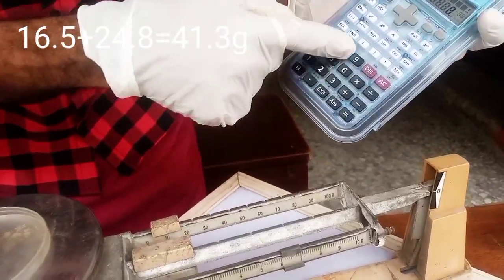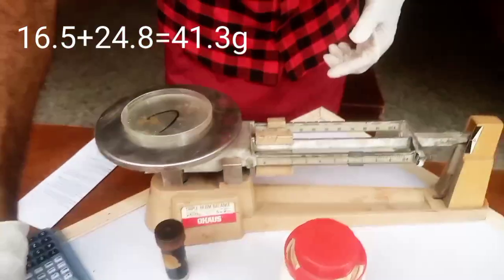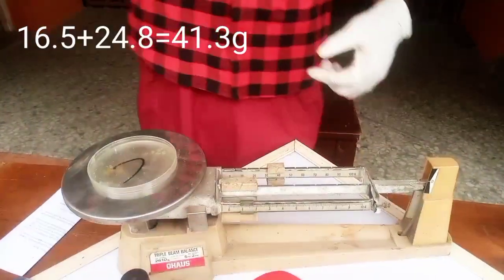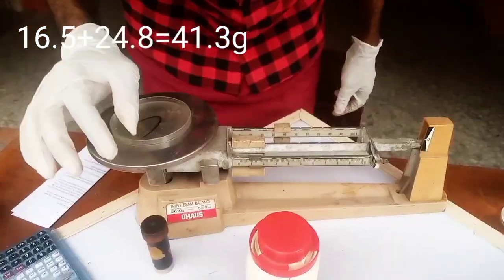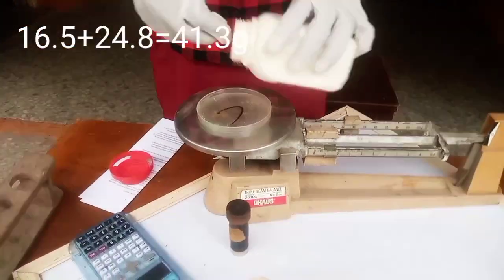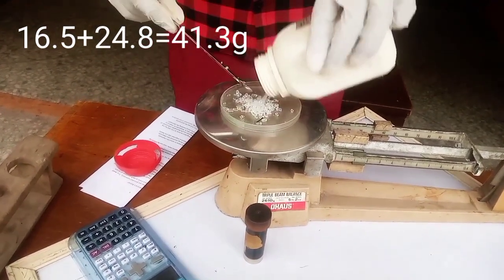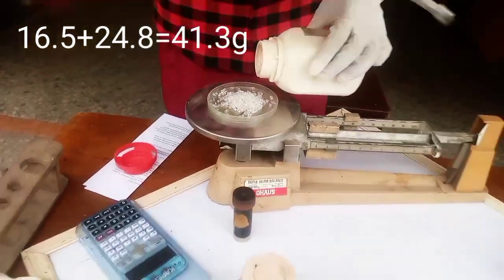And you know what is happening here? I have already gotten 16.5, therefore I need to push the bigger one at 40, then I need to push this one also at 1.3, then I need to bring down my sodium thiosulfate to it and measure it up to that to see when my pointer is at zero. We normally call it at equilibrium or at balance value in that place.